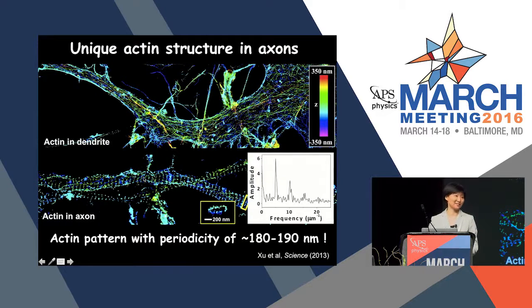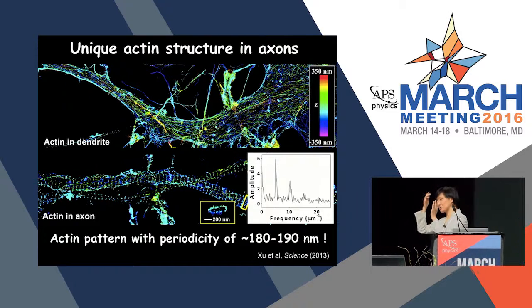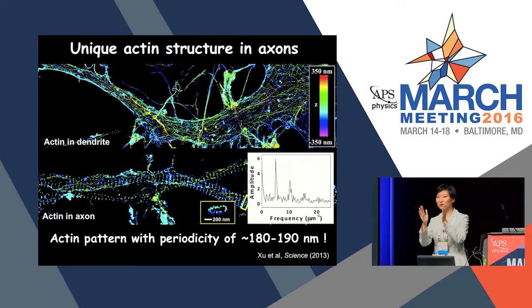And it was interesting when I was talking to a reporter about this, they said, well, that's a literal skeleton. I've not thought of it this way. I think he was imagining a dinosaur or fish skeleton and so on. So if you want to remember it, there is a skeletal structure inside the cell that looked like a literal skeleton.